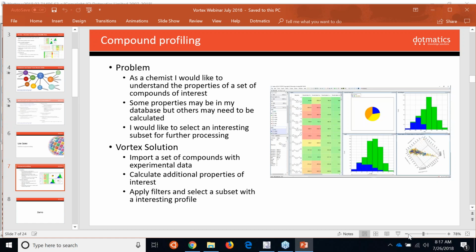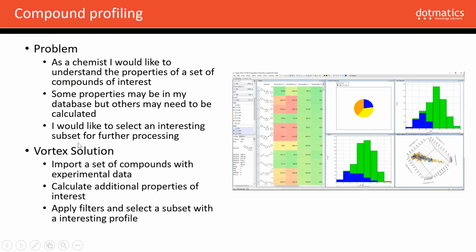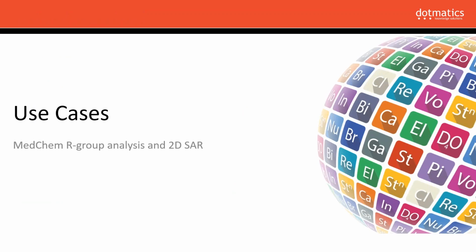All right, so if we jump back to the slides. That's a basic compound profiling, and it also just shows you the basic capabilities of loading data, charting, graphing, making selections. So let's move on to a slightly more sophisticated medchem example.